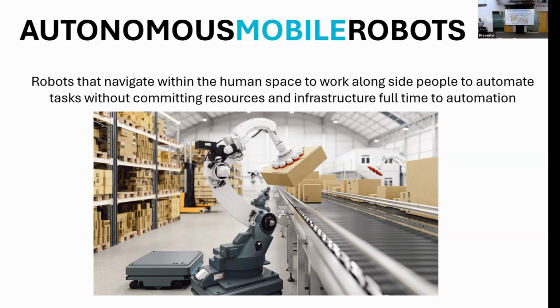Now, these are essentially vehicles that drive around the environment, localizing themselves and path planning to get to their destination and automatically avoid obstacles. Now, they were first released back in the 1950s, but not actually realized in the manufacturing and logistics space until the late 90s. And they haven't made it over to the lab automation space until the mid-2010s.